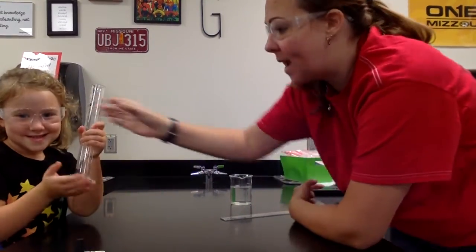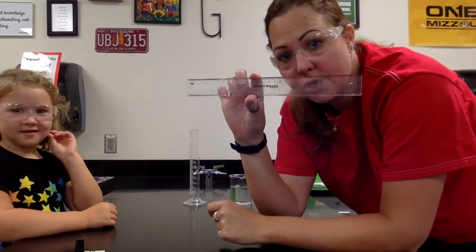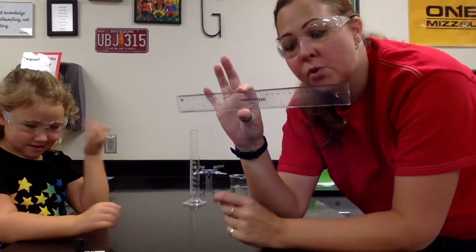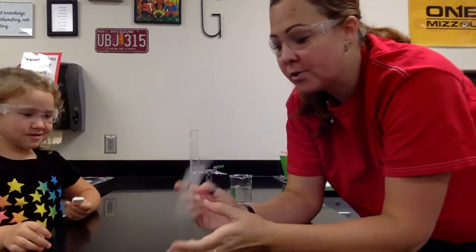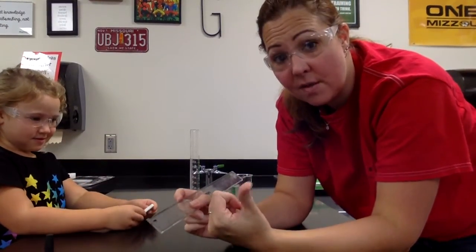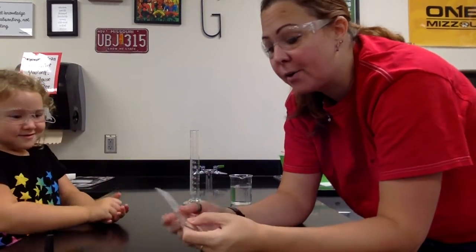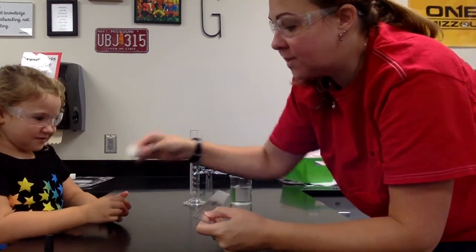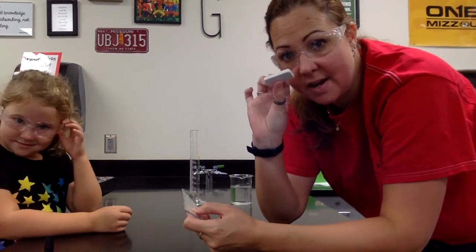The second component for finding your density is to find the volume. There's 2 methods on finding volume. The first one is for regular shaped objects. For your regular shaped objects, you're going to use a ruler. When we use the ruler, we're going to measure in centimeters. When we measure in centimeters, we're going to find out the length, the width, and the height. Length times width times height is my volume. So all that I'm going to do is I'm going to pick one side. I don't care which side you pick as the length, the width, and the height.